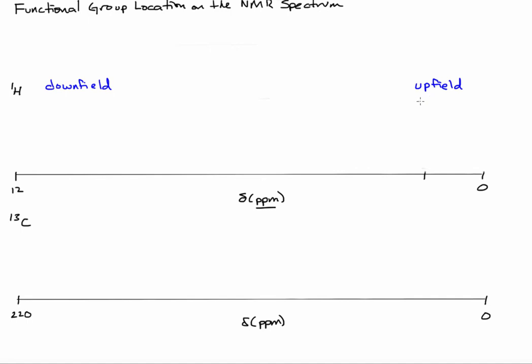So in the upfield region are saturated carbon. So we're talking about the proton here. So we're looking at sp3 type carbons.